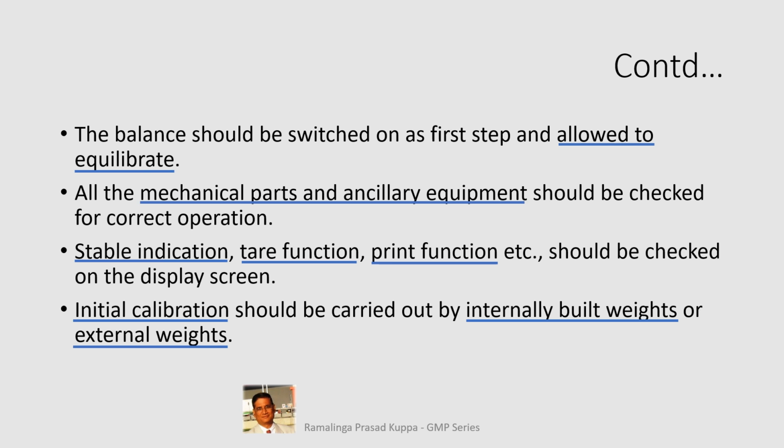While calibrating with the external standards, care should be taken to avoid accumulation of fine dust over smaller weights, which will change the standard weight adversely. You must use suitable forceps. All the standard weights should be stored well in a suitable container. You should also avoid excessive handling, like hitting against a hard surface or dropping on the floor.